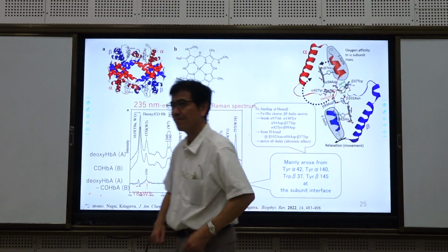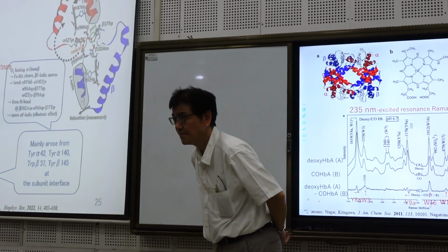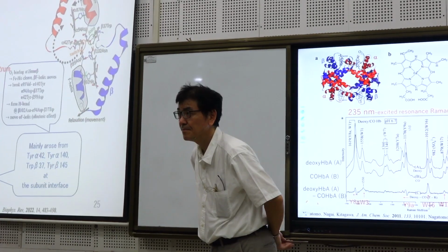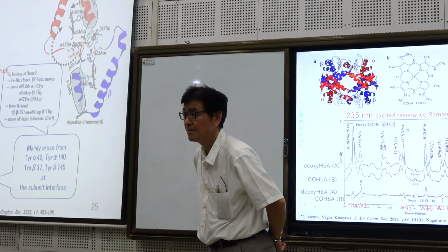Sorry, we don't have the opportunity to change the wavelength of the laser. We have some fixed lasers. So is it good to choose the excitation source near the absorbance?